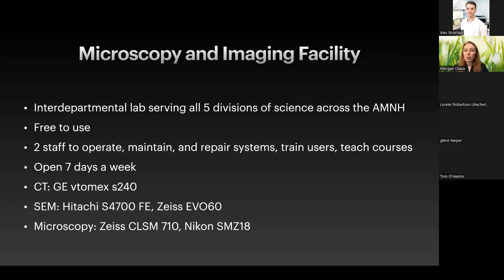I don't know everybody's instrumentation or microscopy or imaging experiences, but I will talk as if you have a little bit. And if you have further questions, I will be happy to talk more. So that's our larger chamber, rather than cabinet, SEM.